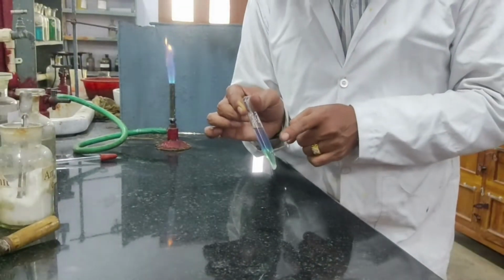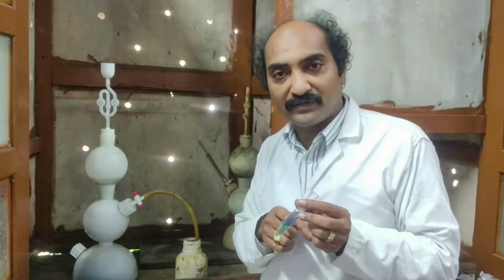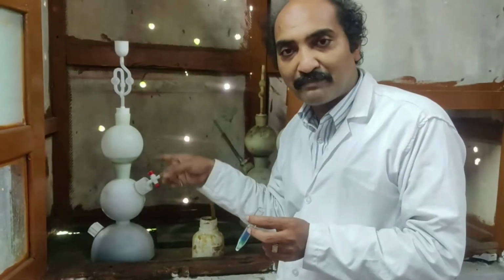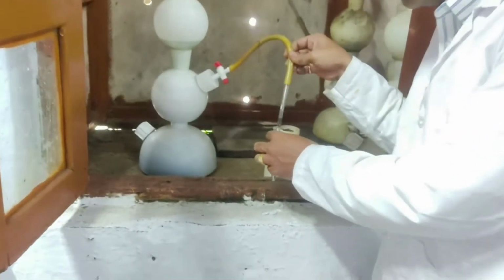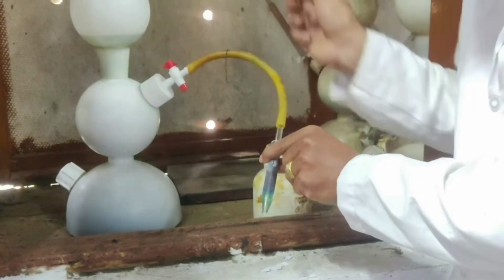So let me pass H2S gas through this. Until now, what did I do? I have taken the fourth group solution supplied to me by the lab attendant. Then I have added ammonium chloride excess, ammonia. Now I have to pass H2S gas through this. So I came to the KIPS apparatus for passing H2S gas. So I am passing H2S gas. Slowly turn the knob on. You see beautifully H2S gas is being passed.